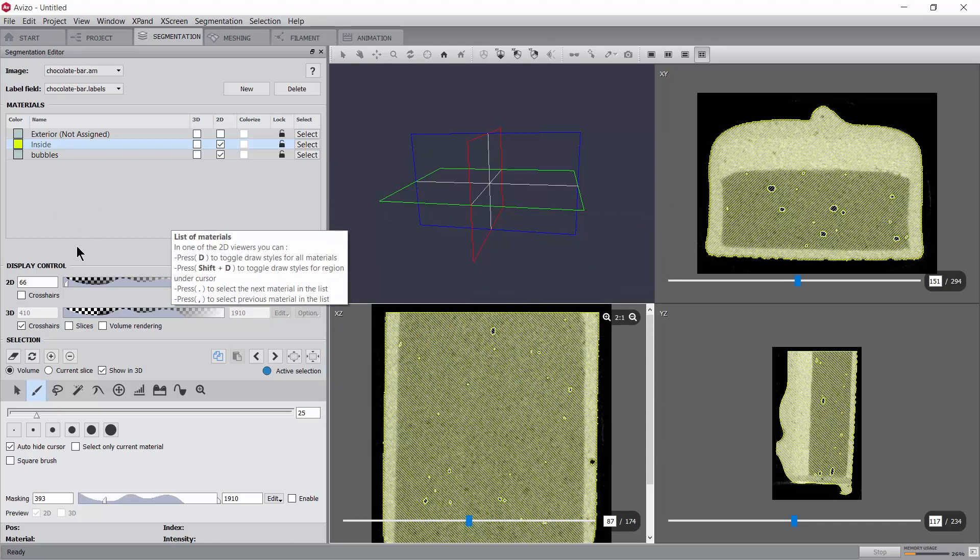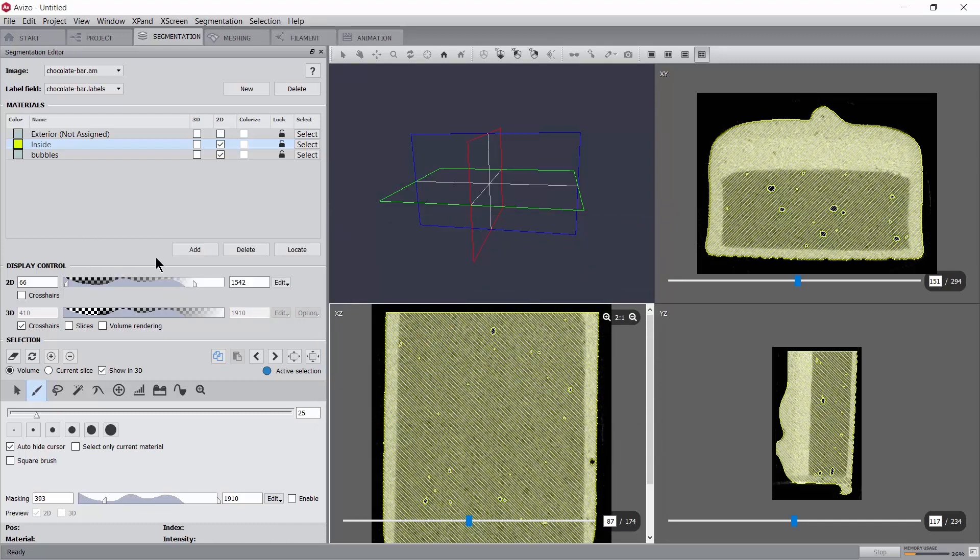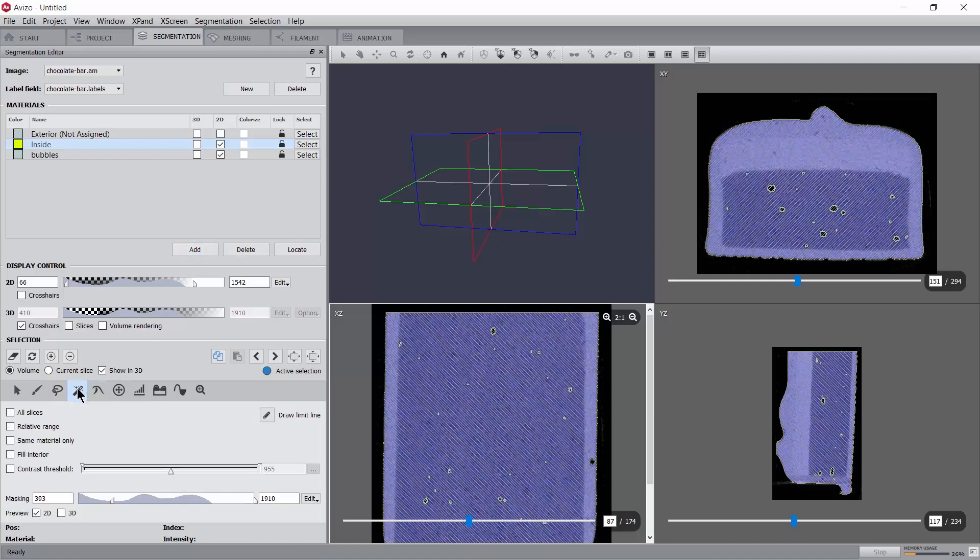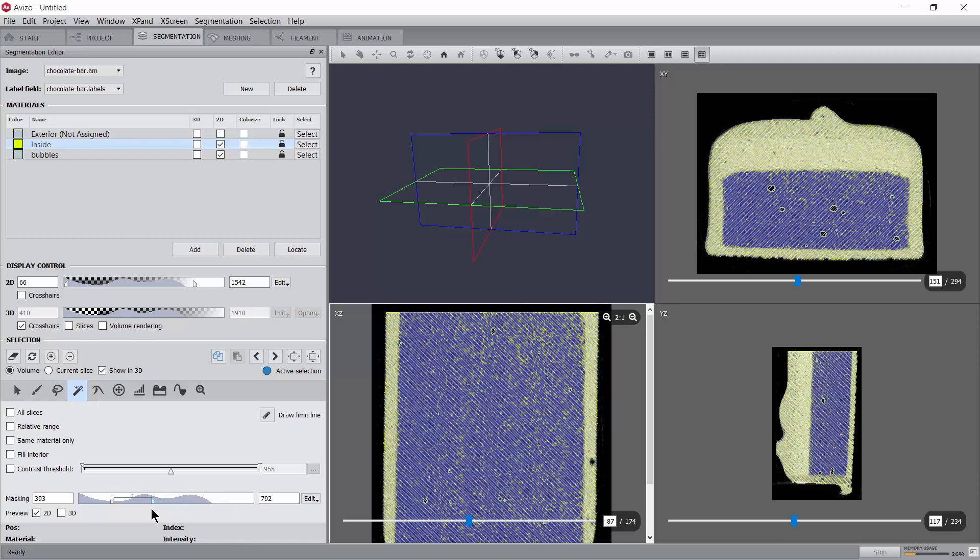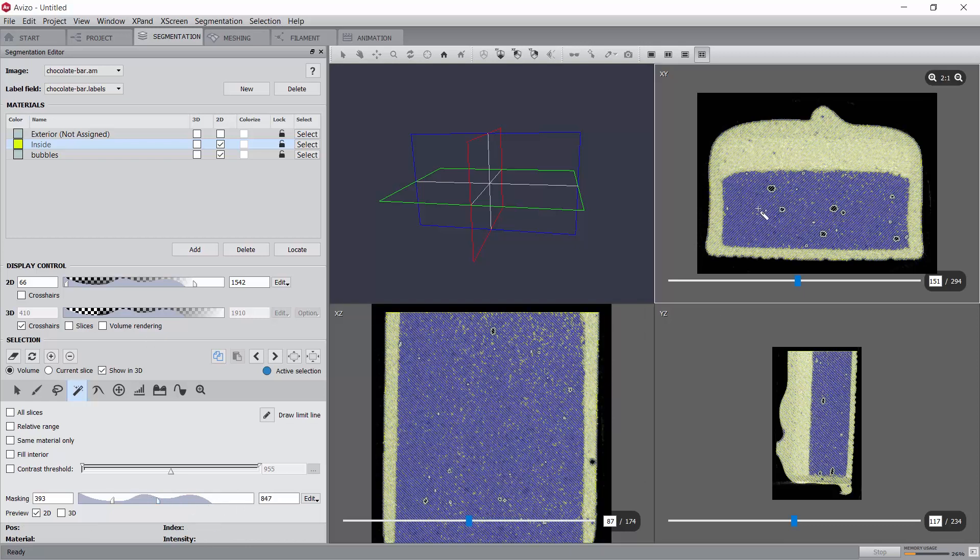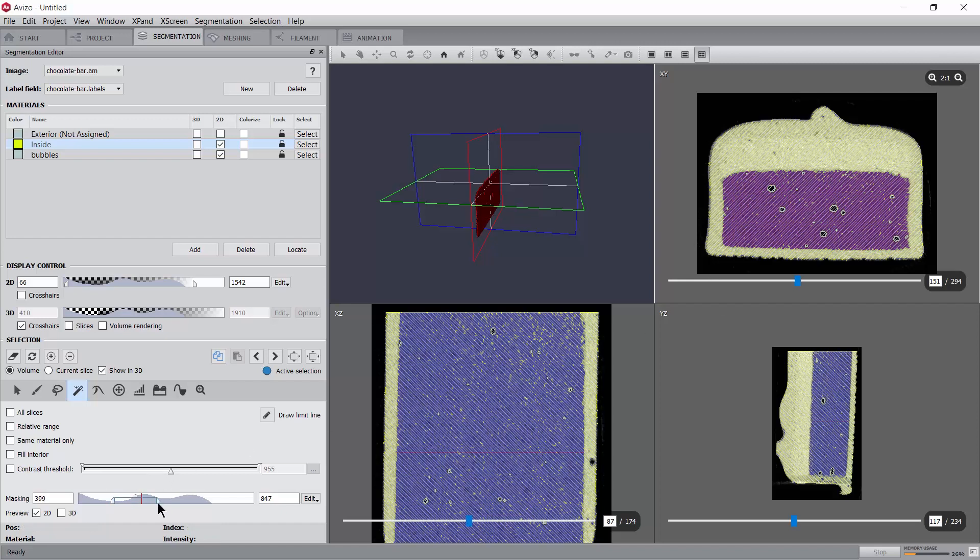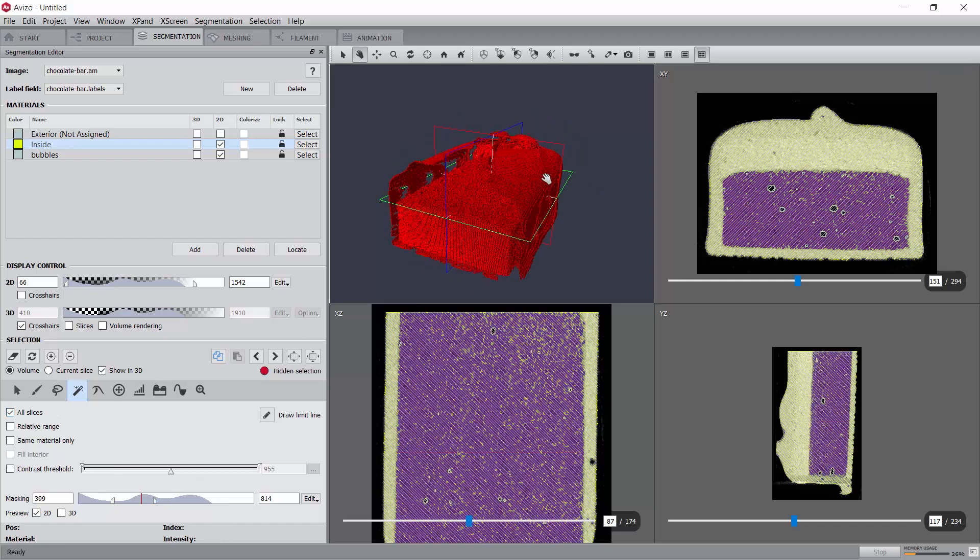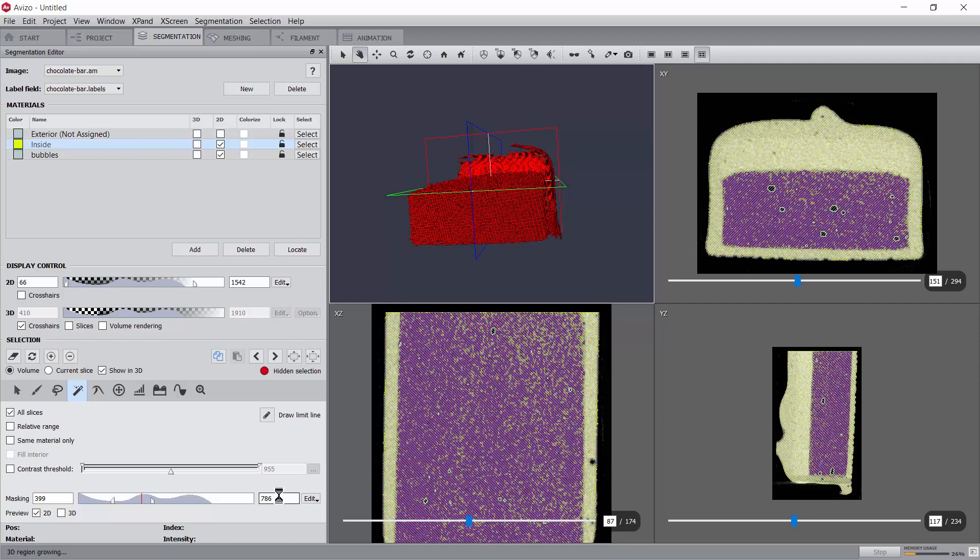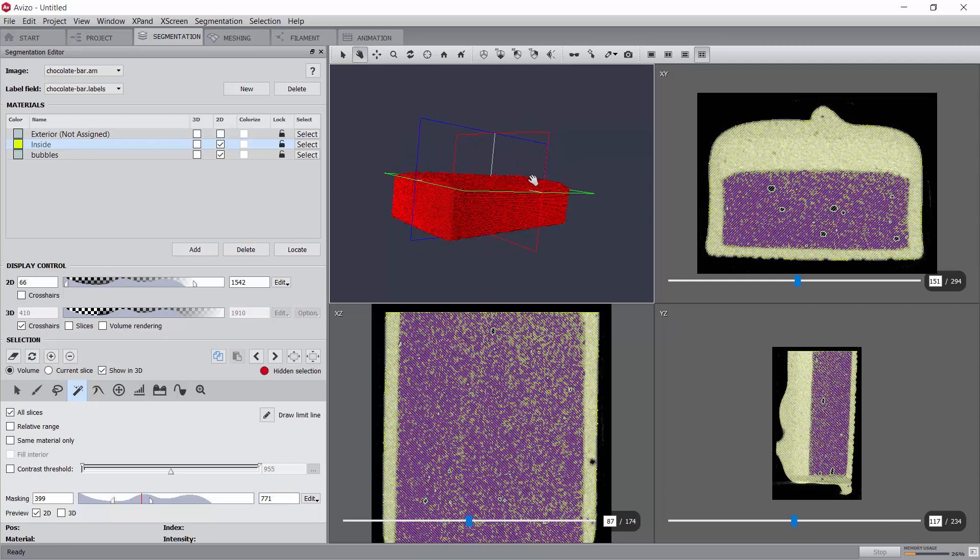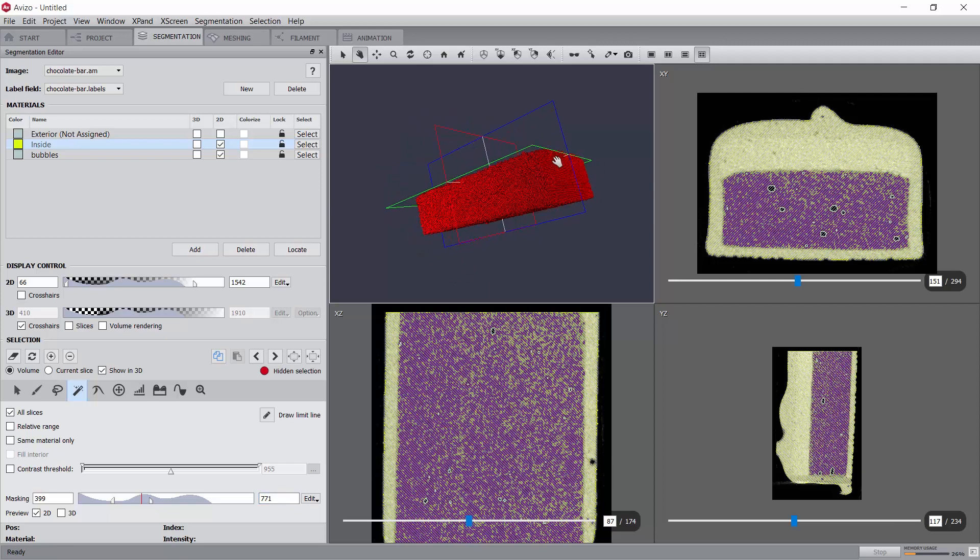Let's continue with the segmentation and segment the mousse filling, visible as a dark grey in the image, in a new material. For this, we will use the magic wand tool. This tool basically grows the selection starting from the clicked pixel and propagating into adjacent pixels, provided they respect the requested intensity range. A useful trick here to adjust the threshold value is to position the mouse cursor on the box and rotate the mouse wheel to adjust the value and update the display simultaneously.